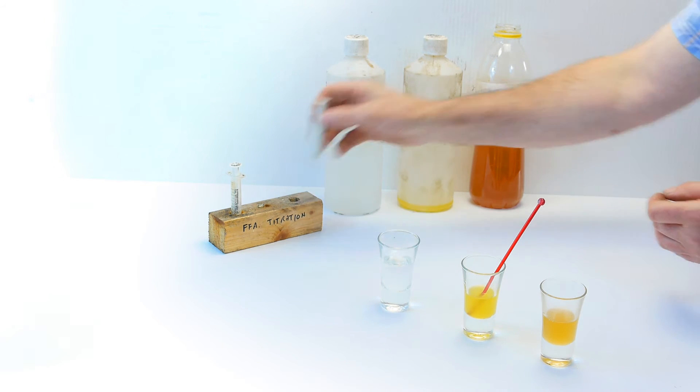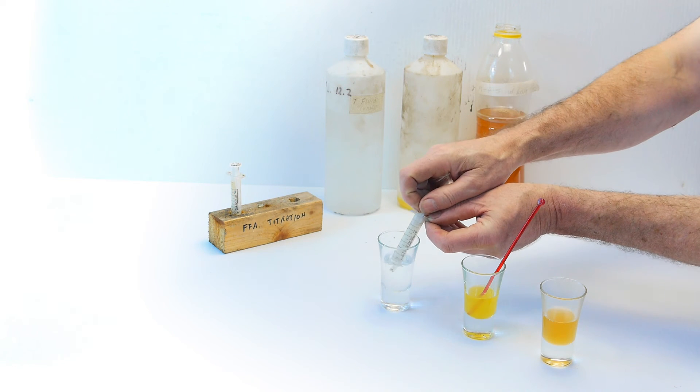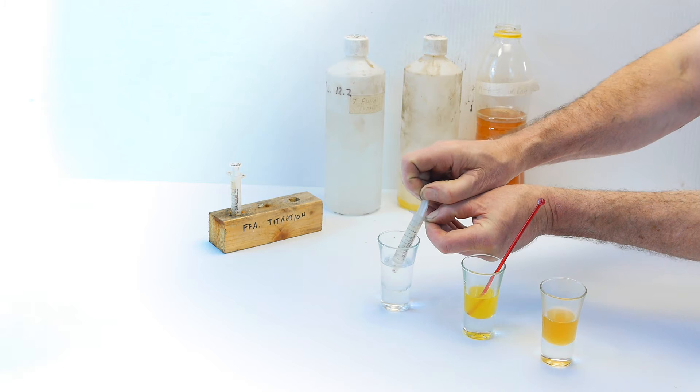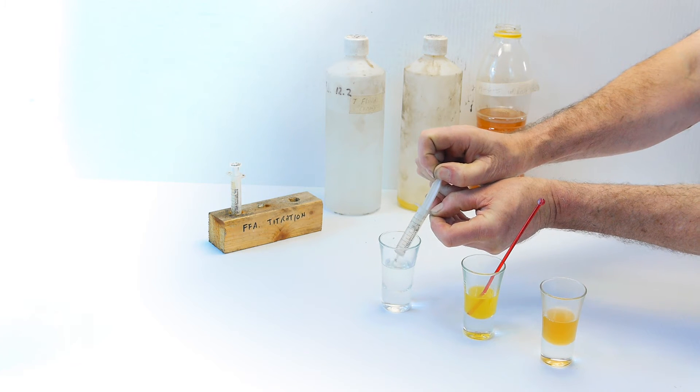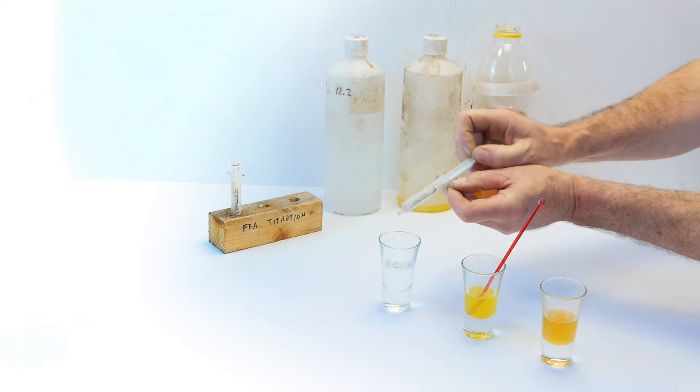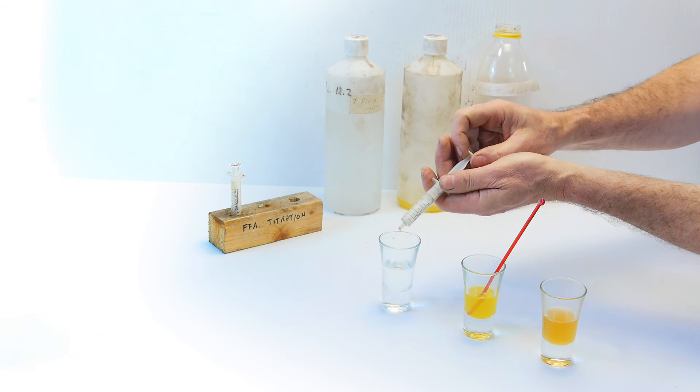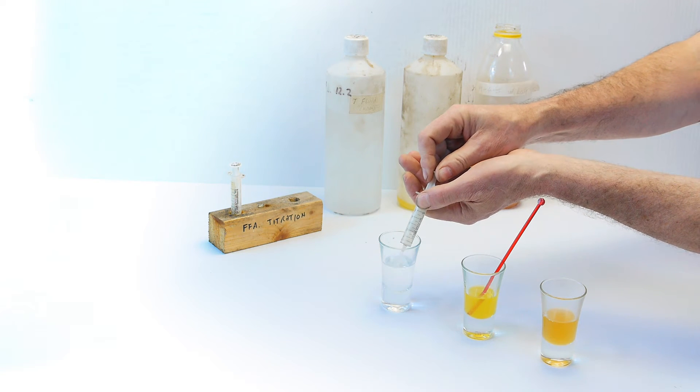Now, fill the other syringe, the syringe marked T, with titration fluid. Fill it right up to the five mill mark. Make sure there's no air in the syringe and that it is properly full to the five mill mark.